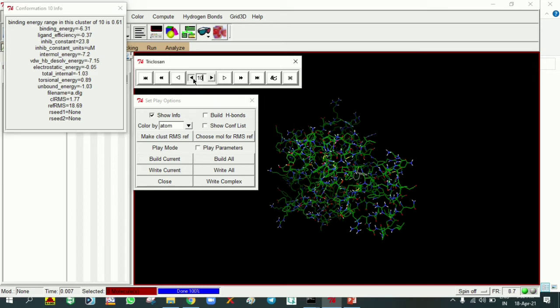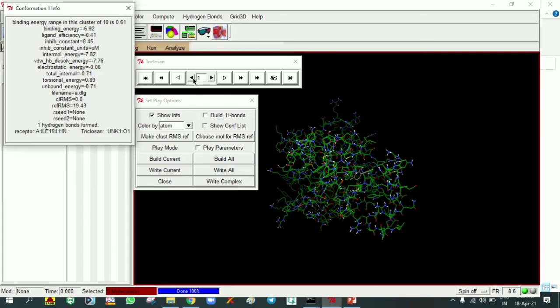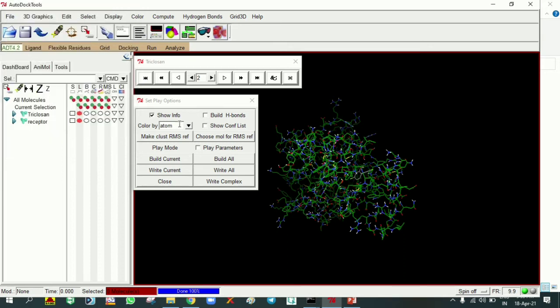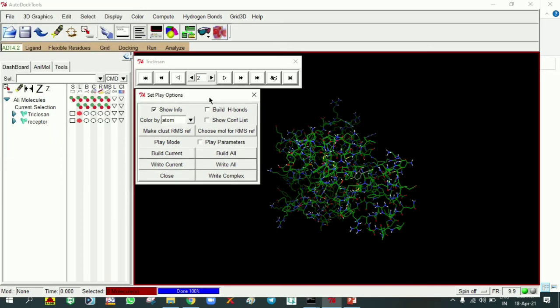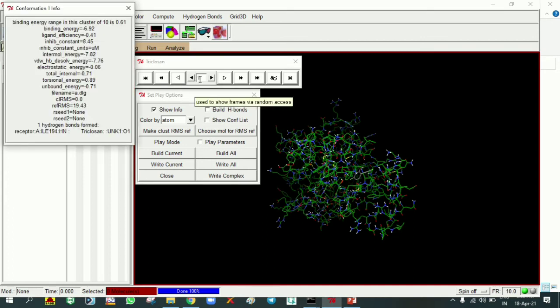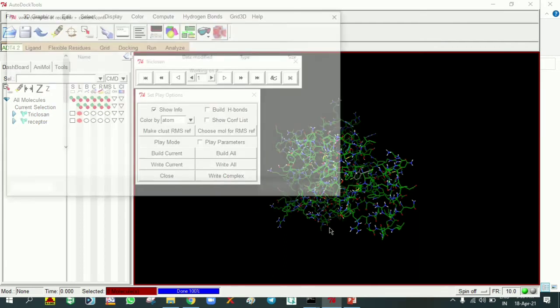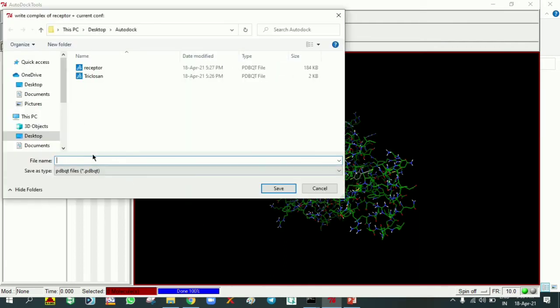Among these, if you observe, conformation 1 minus 6.92 and conformation 2 minus 6.87 along with hydrogen bond formation can be observed. To download this complex, the ligand and protein complex, the conformation 1 is there. We can make it write complex. We can save in PDBQT format. I'm mentioning it as complex 1, that is conformation 1, PDBQT save.